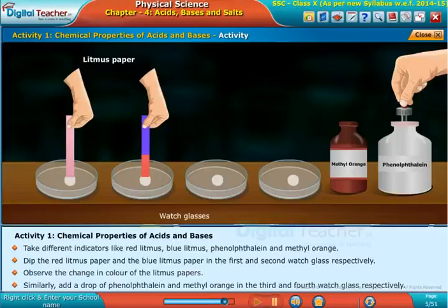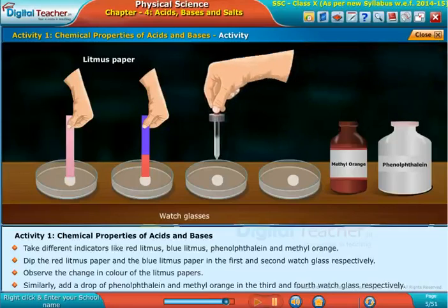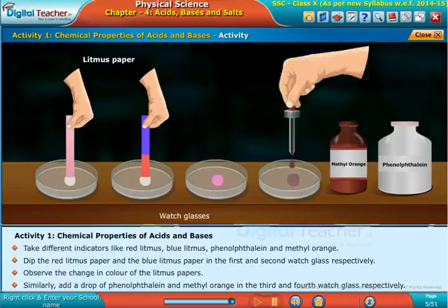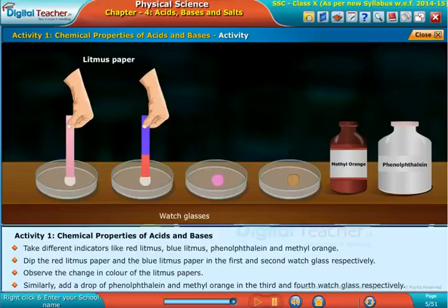Similarly, add a drop of phenolphthalein and methyl orange in the third and fourth watch glass respectively. Note down the observations in a table. Repeat the same procedure for remaining substances.